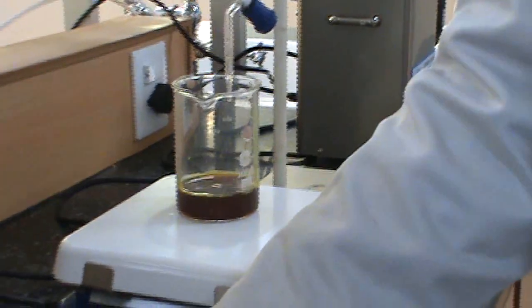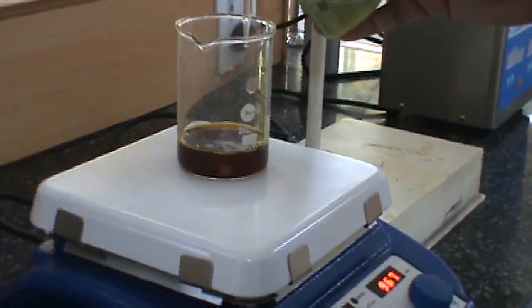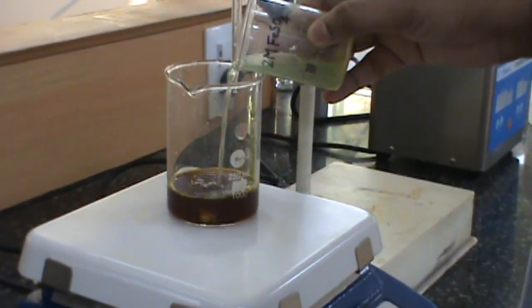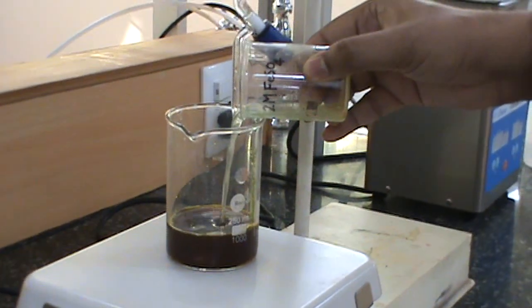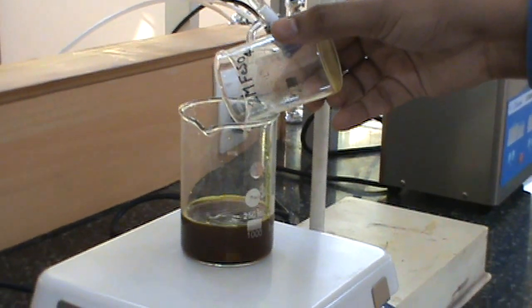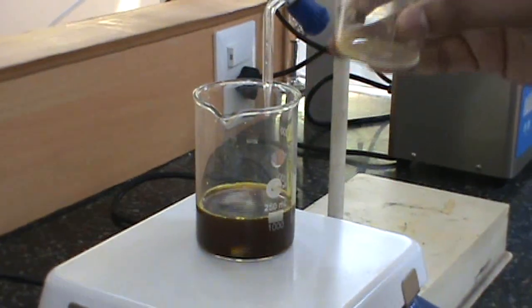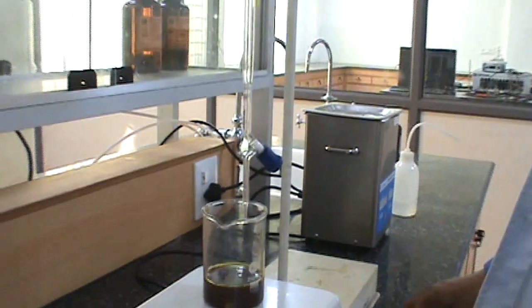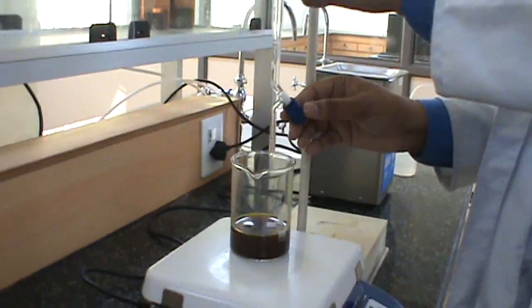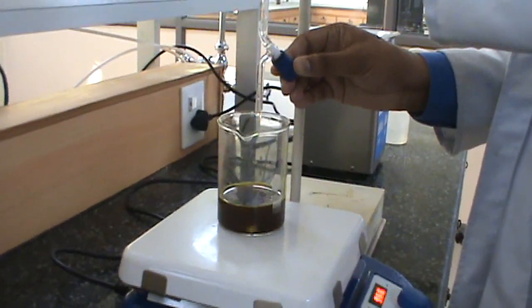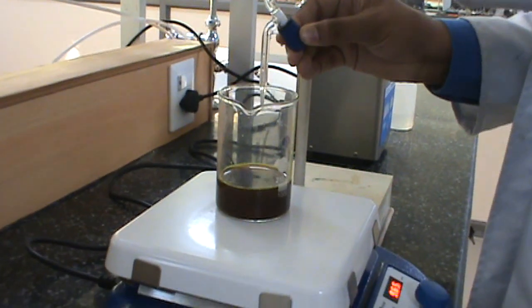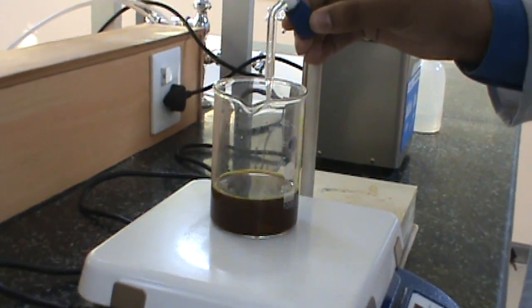Then we are going to mix the Fe2+ sources. We have already filled the ammonium hydroxide in the burette and we will add it dropwise. You will see that iron oxide will start to form as a black precipitate, and we have to do this slowly in order to maintain the particle size.